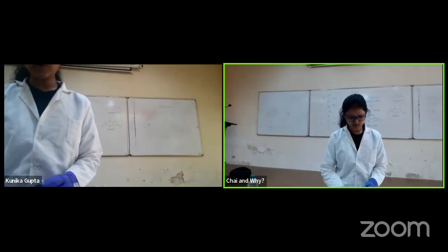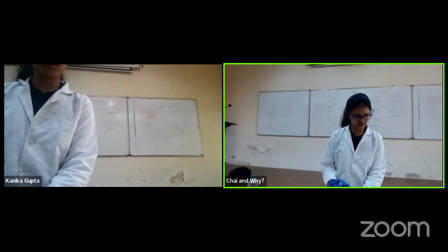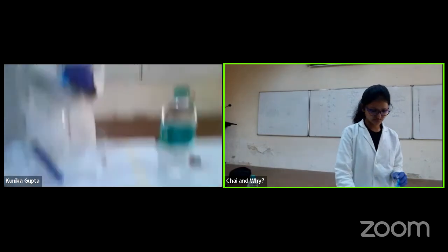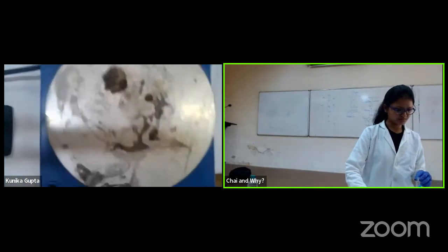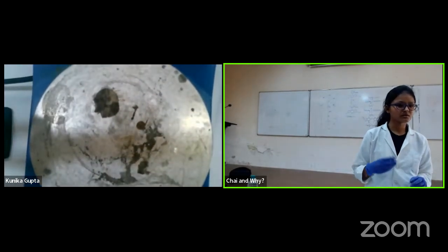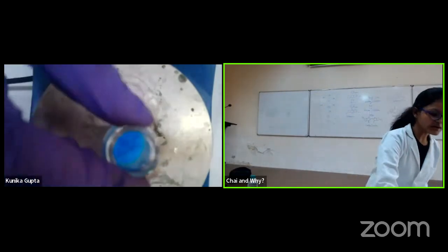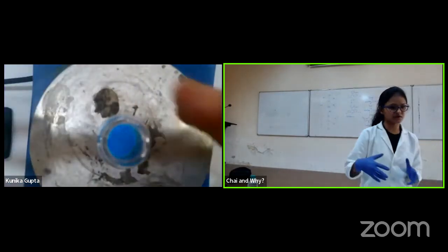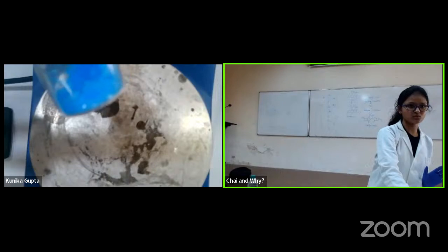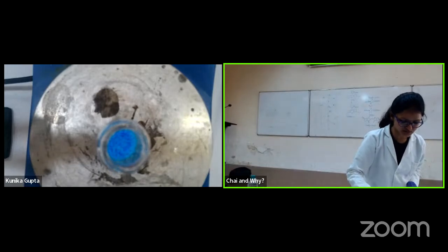So I'll put some amount of this, not the entire thing because it's too much. Are you going to do it on the heater? Yes, because I'm going to heat it. Okay, so let us do one thing. Let's bring this here. Don't touch it. So we'll keep this also for a while, and meanwhile I'll do the other experiments. You can see it clearly, it's pure blue, nothing else. We'll keep it for heating, and this one is for cooling, which I don't see anything happening, but still let's wait.